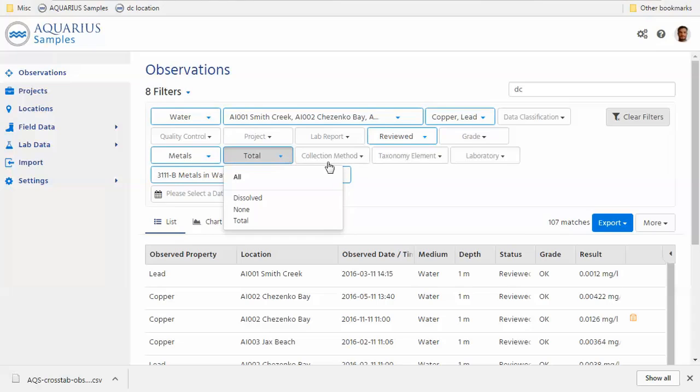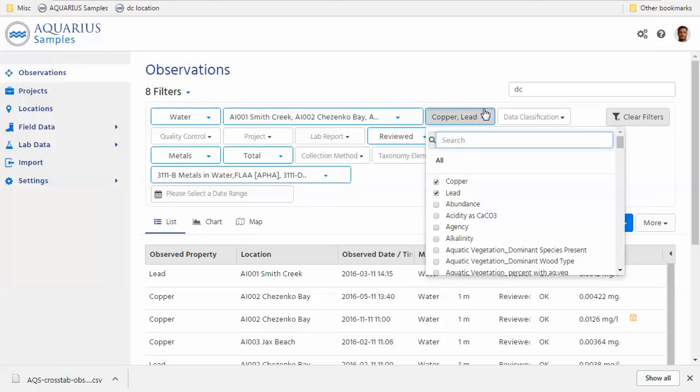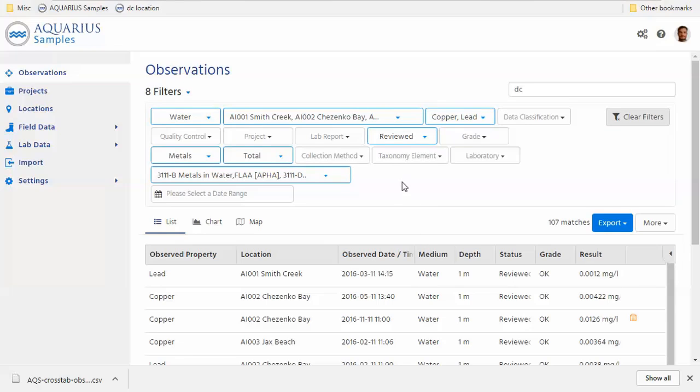And you may be wondering, why is that important? How does that help anyone? By having this data model, this really reduces the effort for data managers to keep their data quality up high, since the metadata such as analysis methods, detection limits, these sort of things, will change over time. But this is built into the model, so you can track your observed properties like copper and lead, and then per result, the individual metadata can change over time, but this is handled by the model. The model supports that. So this is really reducing my long-term efforts of housekeeping of available metadata for my results.